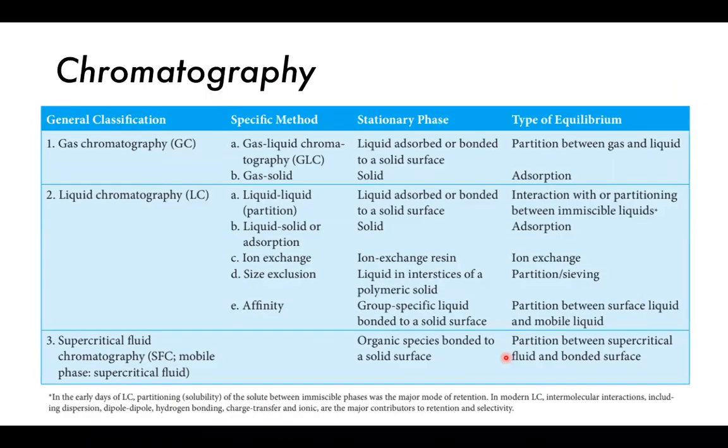So, different types of chromatography. We have gas chromatography, as we've talked about, and liquid chromatography as well. And we also have supercritical fluid chromatography, although that's quite rare because supercritical fluids tend to be quite hard to make. But it is possible. So gas chromatography, GC, is gas liquid chromatography, GLC, or gas solid chromatography.